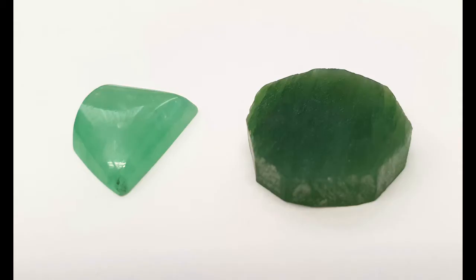Jade absorbs infrared radiation, so it's sometimes very difficult to get an FTIR absorption spectrum in transmission mode, especially for thick pieces. These two samples are both claimed to be jadeite, and we will use the specular reflectance mode to find out if this is true.